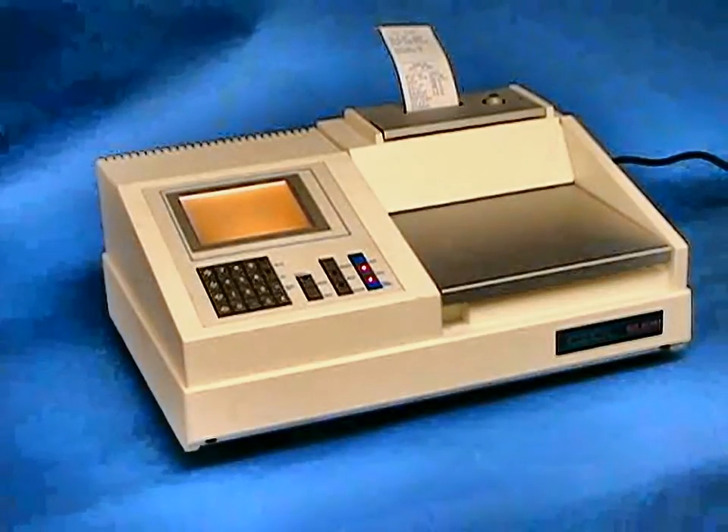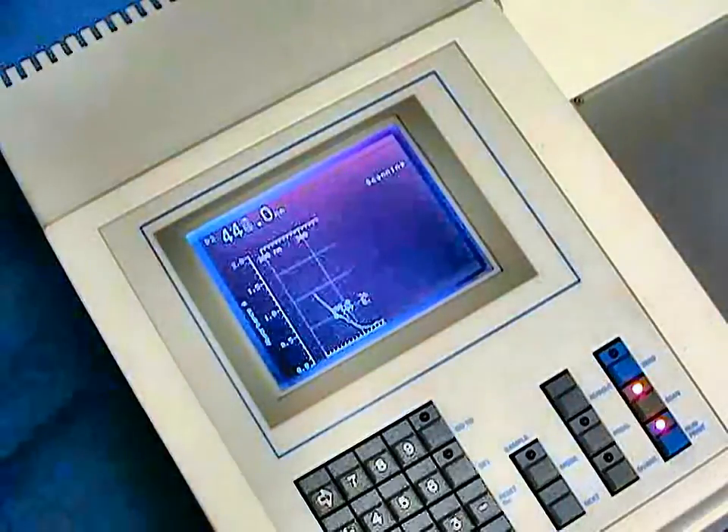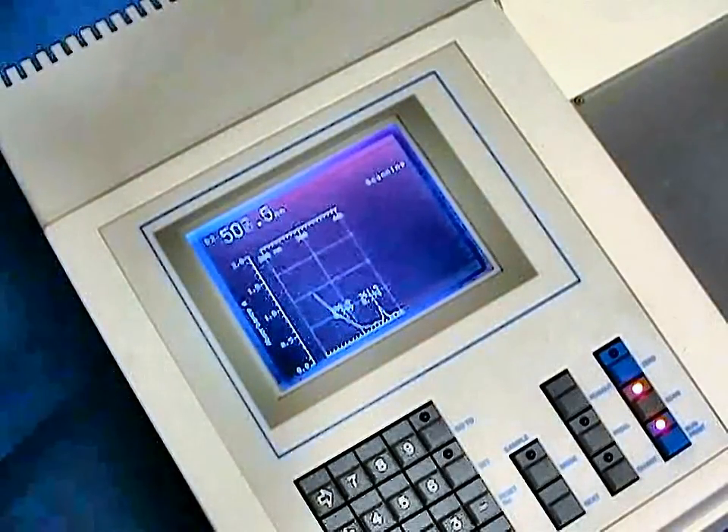The display will show the real-time scrolling of the spectrum as the data is being accumulated. We can see the spectral information being shown on the backlit liquid crystal display in real-time.